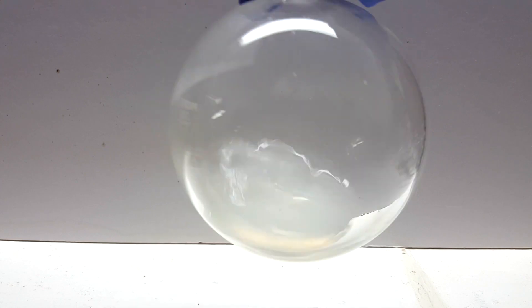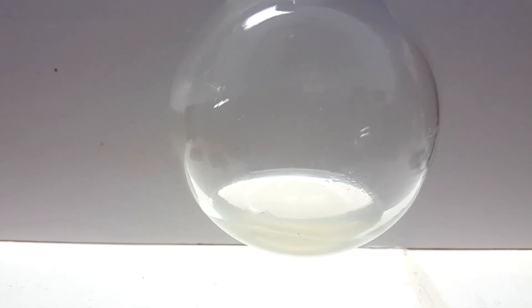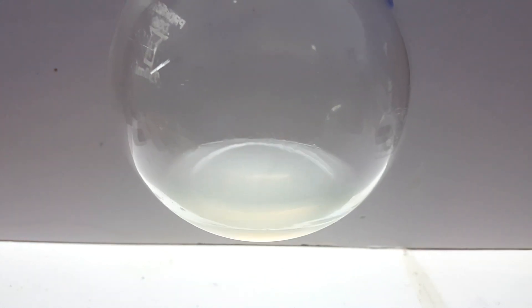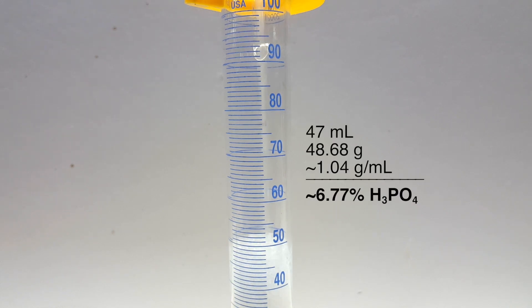Now onto our phosphoric acid. It looks kind of cloudy and yellow, but I'm not entirely sure what this is from. Some of the vapors from the decomposing stir bar may have contaminated the product, but I'm not entirely certain. To determine the purity, I decided to use a density concentration calculator I found online. I tared the graduated cylinder on a scale and added the phosphoric acid. The final product was about 47 milliliters and had a mass of 48.68 grams.